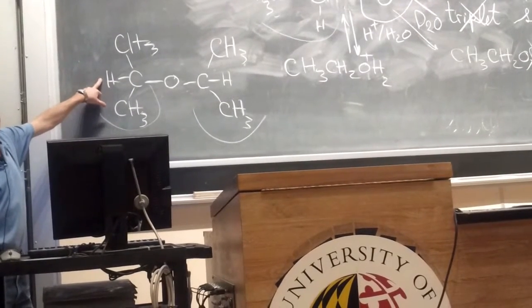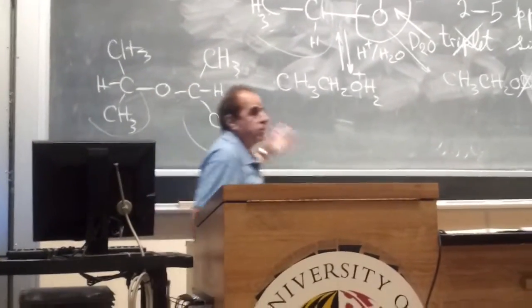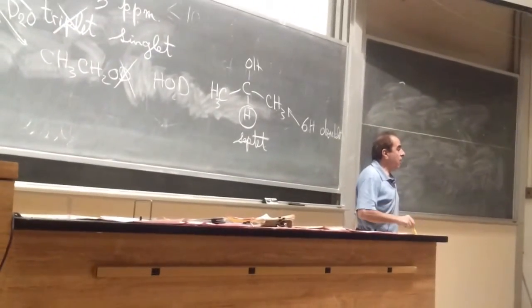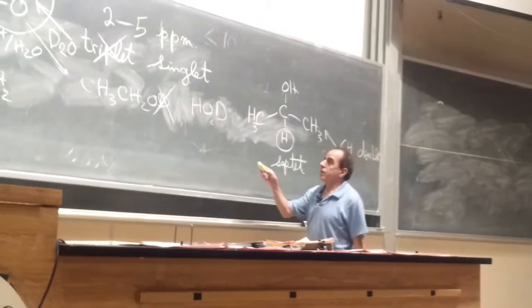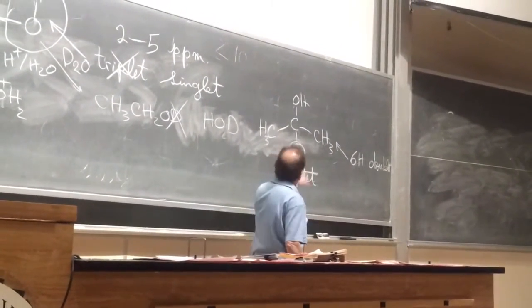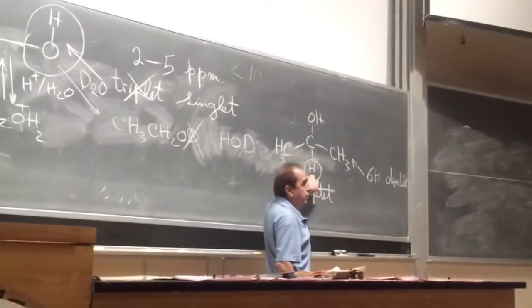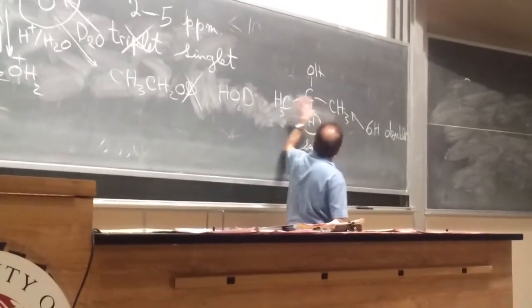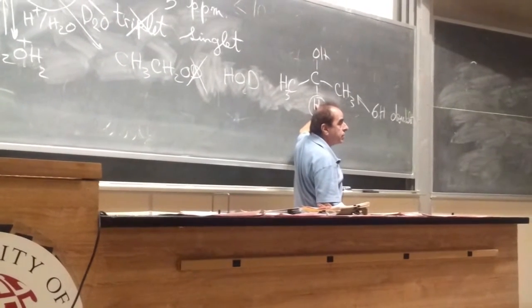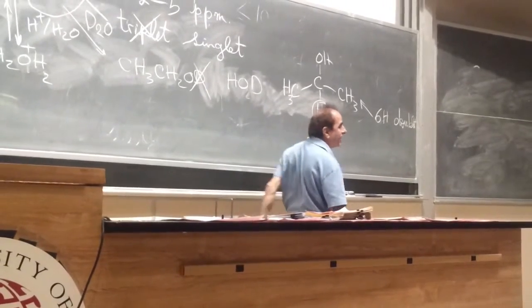That's it. The ratios in NMR, then you have to multiply by 2. Maybe only the relative ratios are shown. Why is it a doublet? Well, N plus 1, 3-bond coupling. You have 6 hydrogens that are equivalent, so 6 plus 1 is 7. No, these six hydrogens are coupled with only 1 hydrogen, so 1 plus 1. You got it? All right.